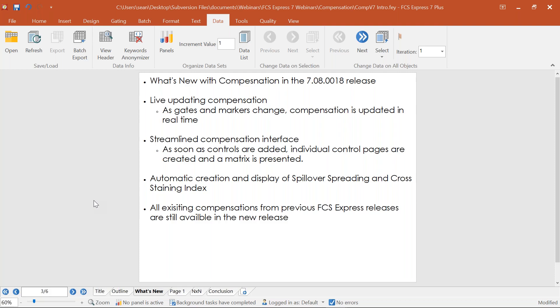The compensation interface has also been completely streamlined. As soon as you add controls into the interface, all of the control pages are automatically generated and the matrix is already generated. FCS Express tries its best to figure out what scatter gates you want, so instead of going through all the steps piecemeal like in previous versions, everything should be filled out for you automatically.